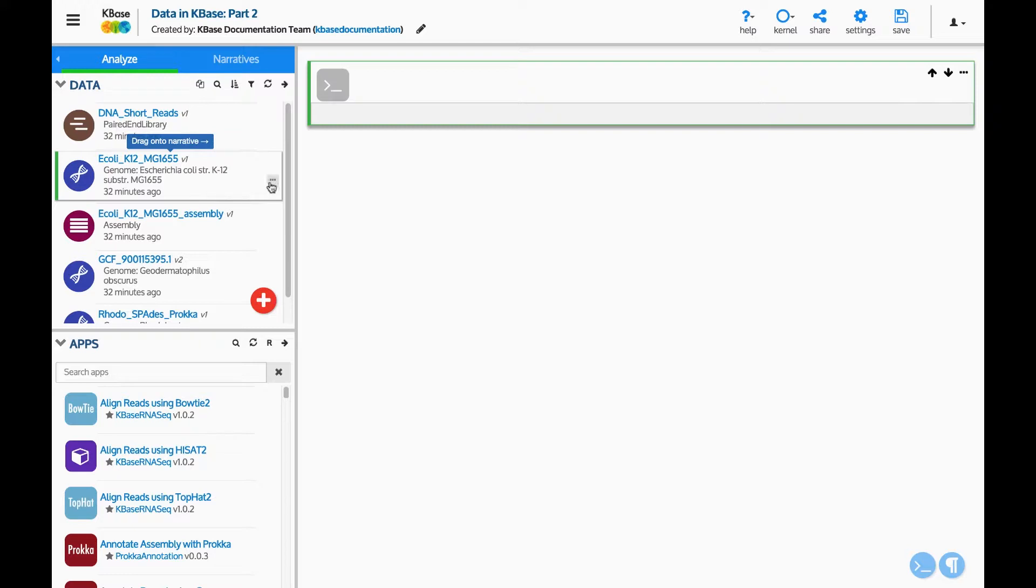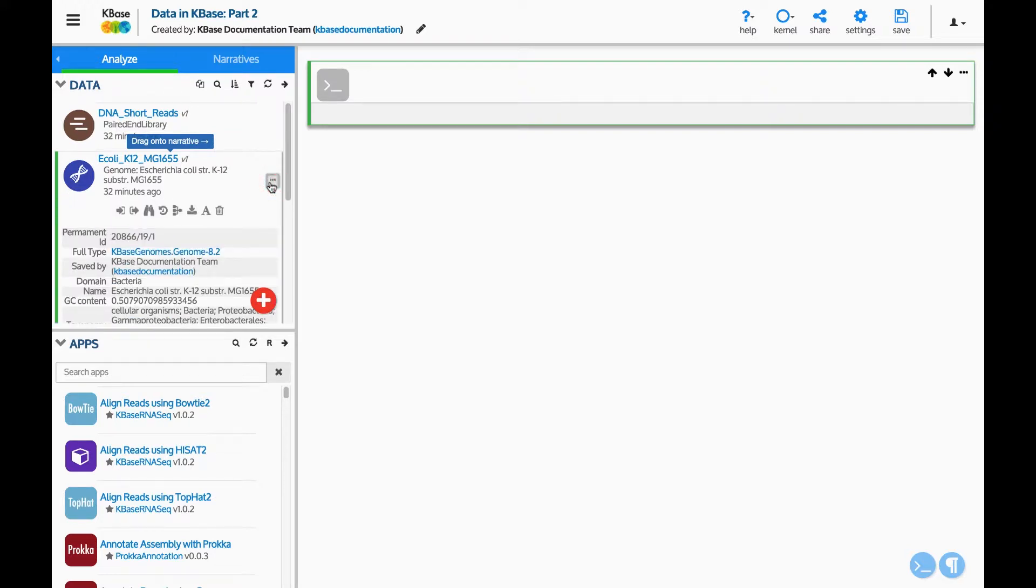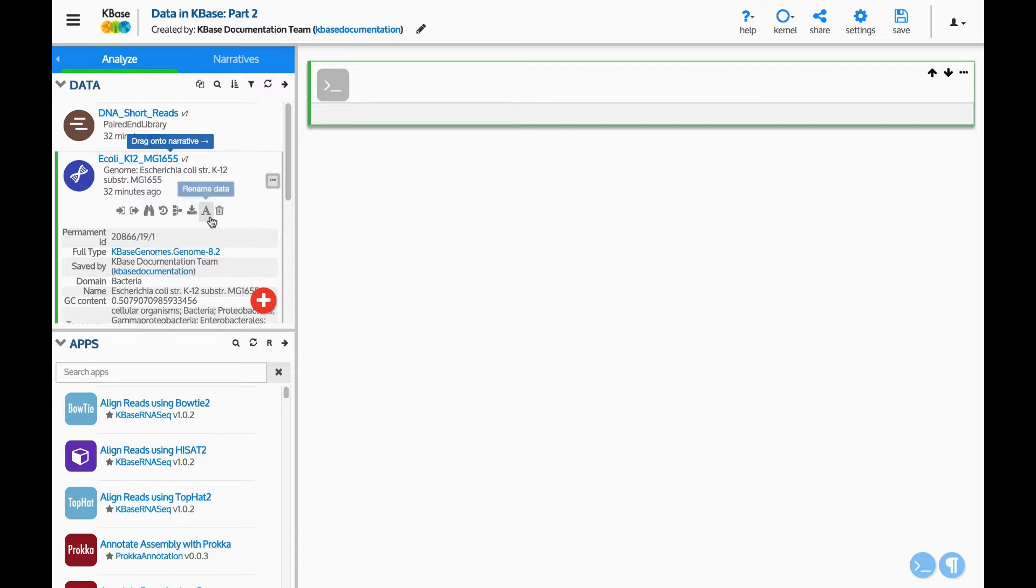By clicking the three dots to the right of the data, more details and options become available. These buttons let you see more information and manage the data. The trash can button deletes the data from your narrative. The letter button allows you to rename the data in your narrative.